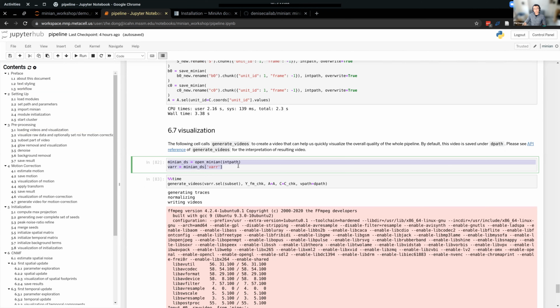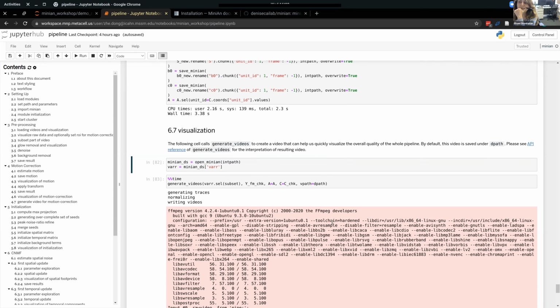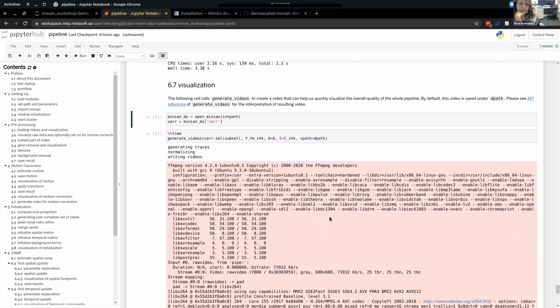And I hope everyone understands what's going on, because it's just variables from before that are lost when we restart the kernel. So you just need to load them again, this cell should be added. Yeah, if you restart the kernel, yeah.